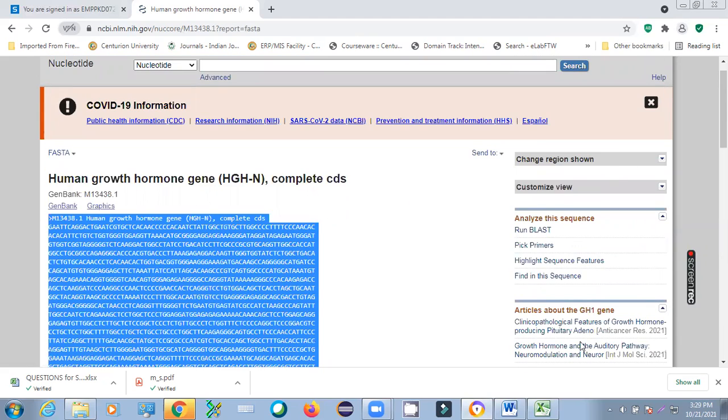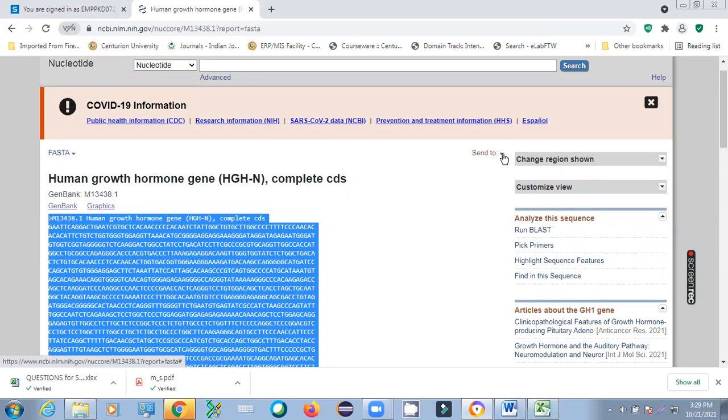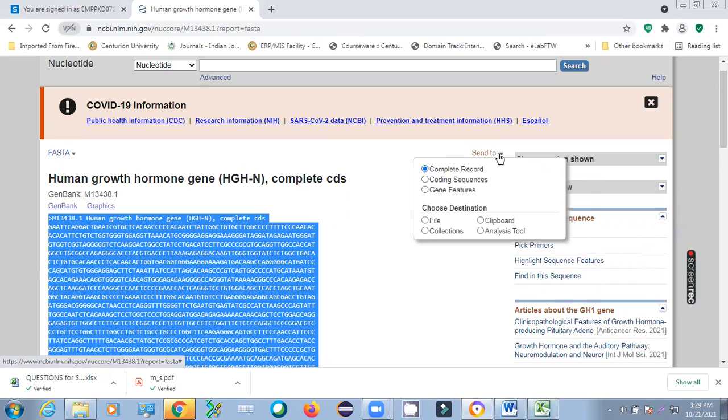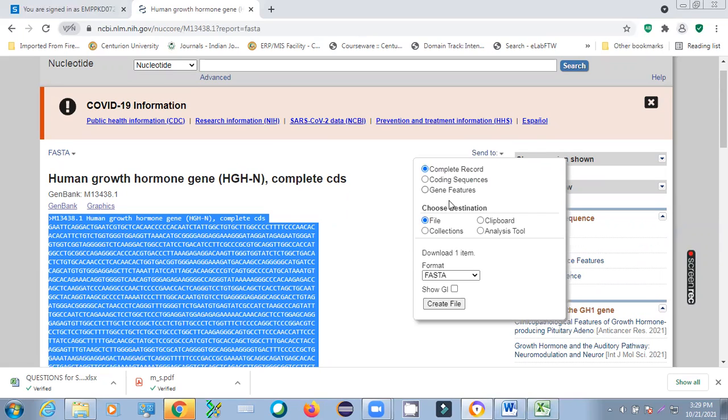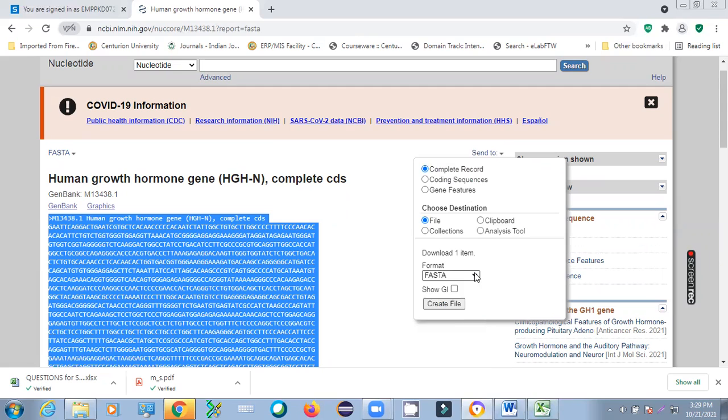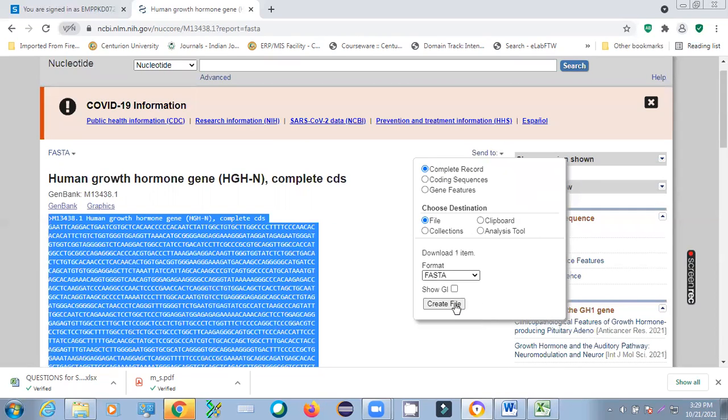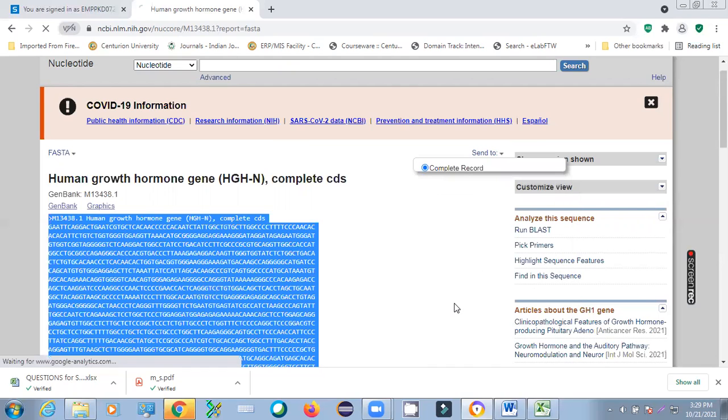You can open any text file. Or another way - you have send. Here, complete record you can do it. Or you can click on the coding sequence features. In which format for downloading? In FASTA. You can see, you can create file. So this way also you can generate the file.